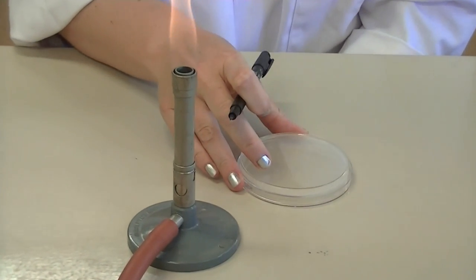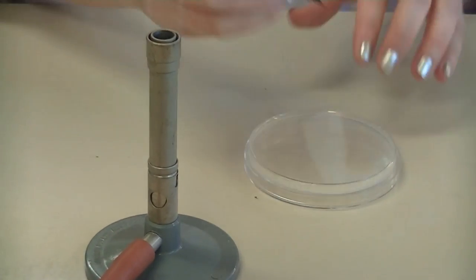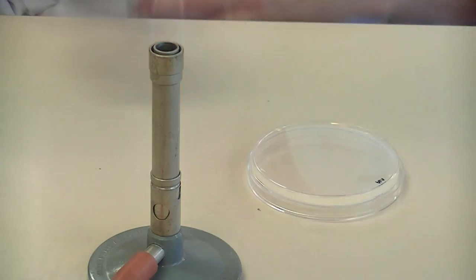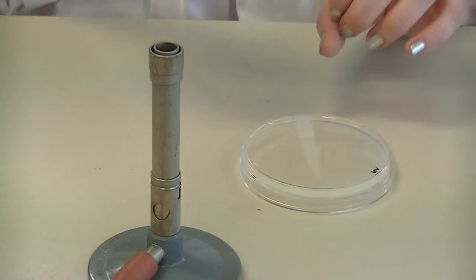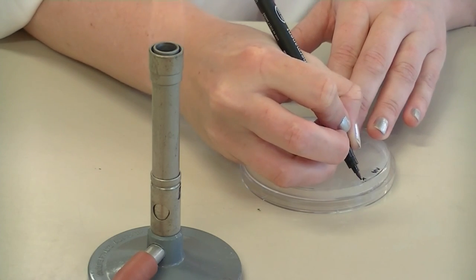Because this is a nutrient agar plate, I'm going to label the plate with N-A, the abbreviation for nutrient agar. You should also include your initials from your first name, your middle name, and your last name.